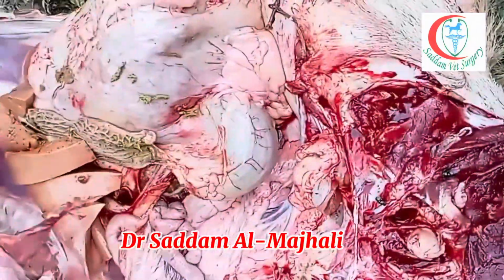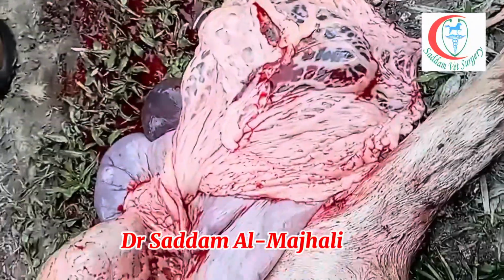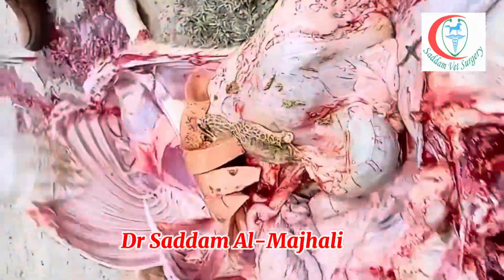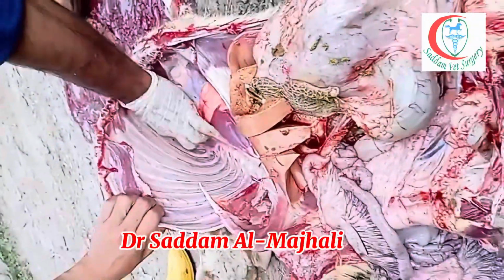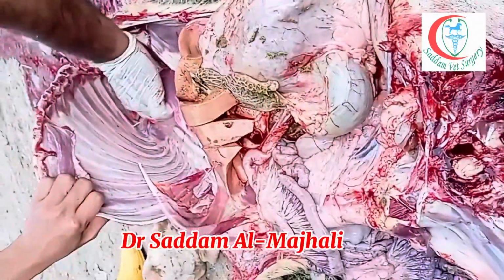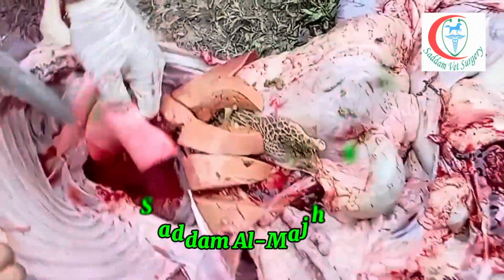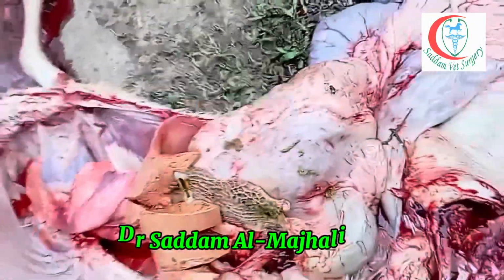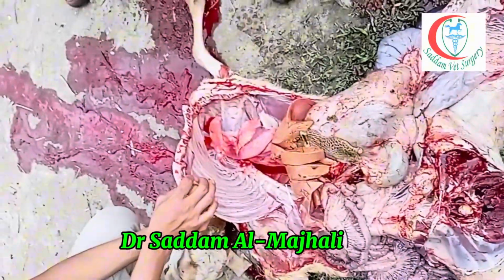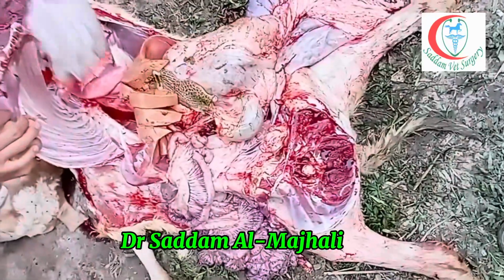So you can continue to open. Touch it. This one, the right side. Right. I want to see the left side. Left side is bowel. See? This is the left side. Left side, nothing. See? Why no congestion here? Not black? Because when she sleeps on that side, no blood comes here. Blood comes down. She slept on the right side.